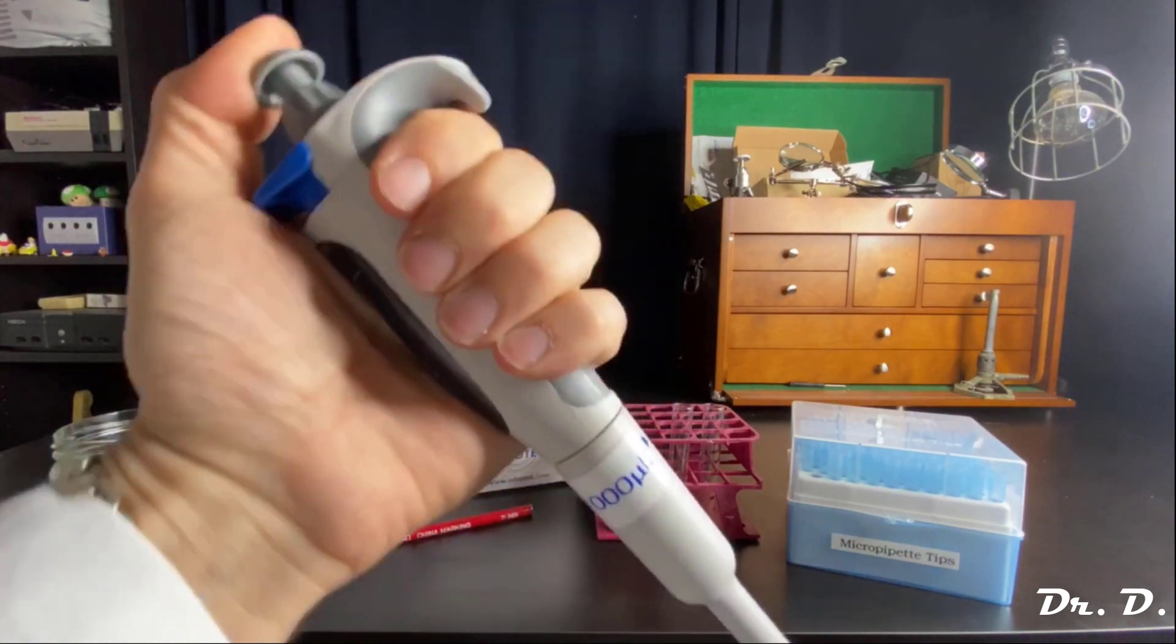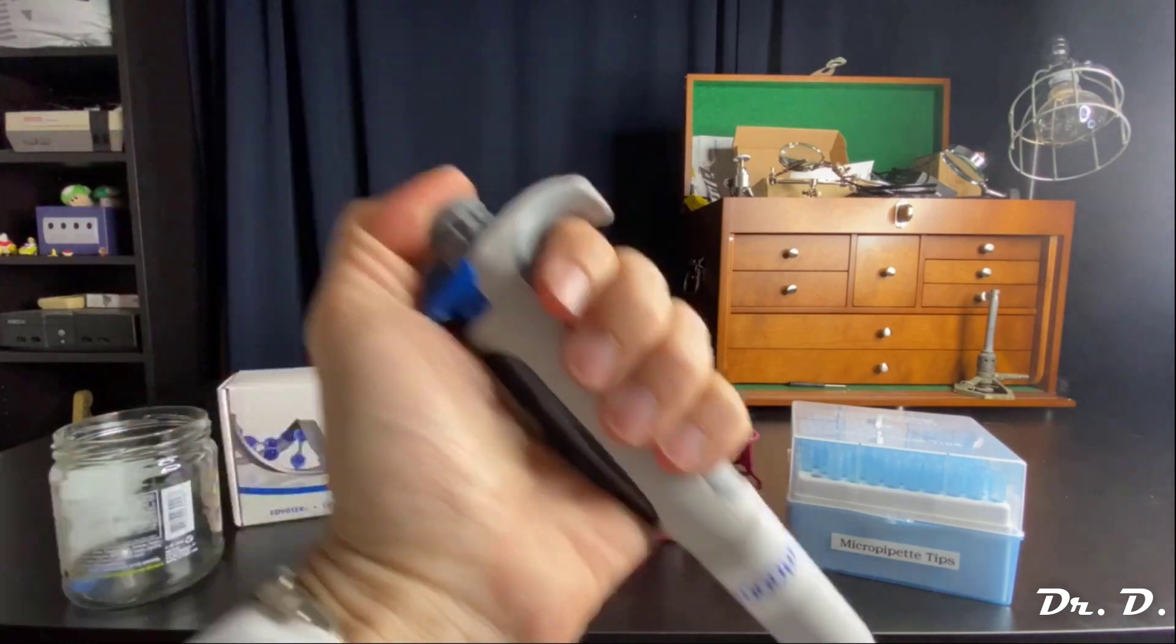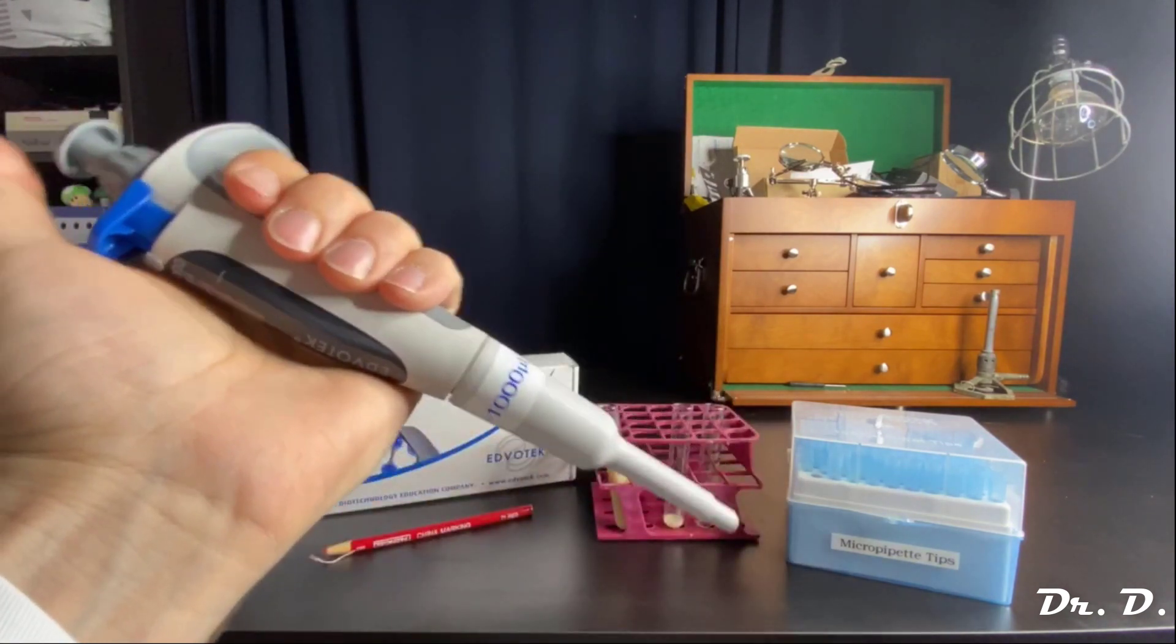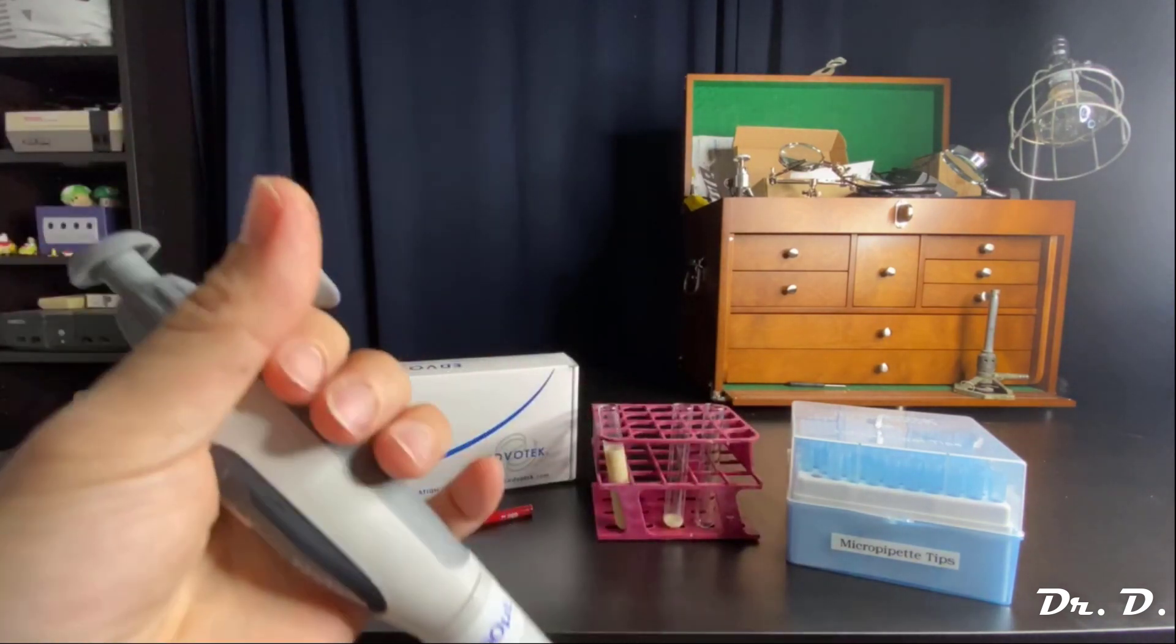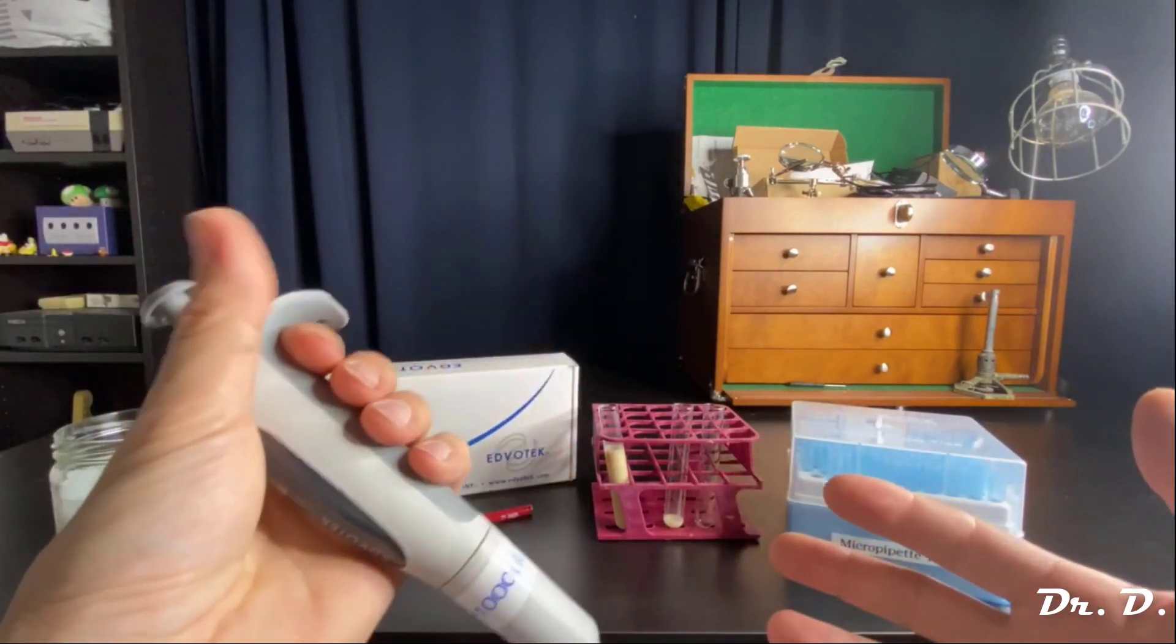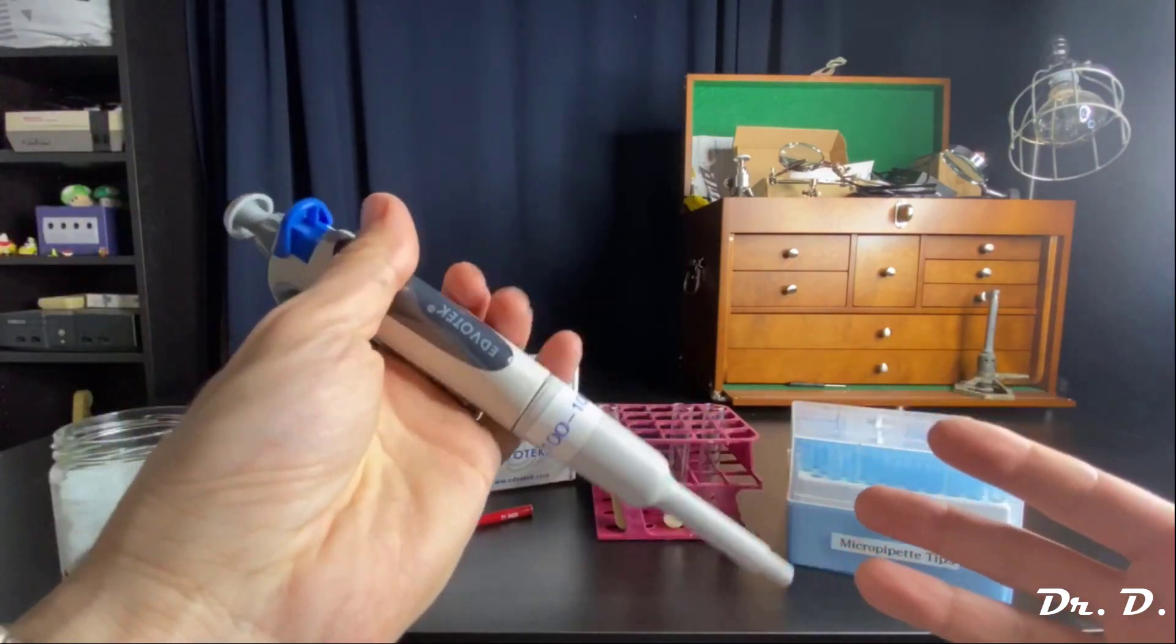And the gray button I told you was the plunger. Remember, first stop for sucking up. Second stop for aliquoting. And so you can just play with it from there. That's pretty much all there is to it. There's really no mystery to this Pipetman.